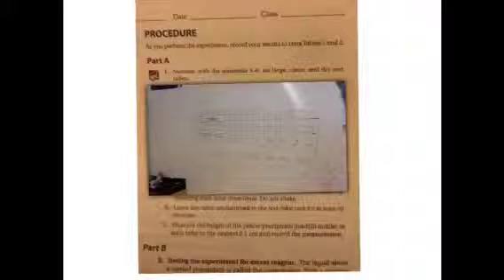We had to make a slight adjustment to our procedure because of some difficulties and some lack of sodium iodide. So we still numbered 6 large clean dry test tubes, 1 through 6, as we can see above, and we put different amounts of Pb(NO3)2 and NaI in each one. We also changed the amounts, so we followed a different procedure in this section.